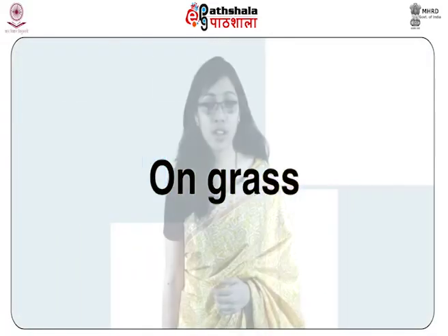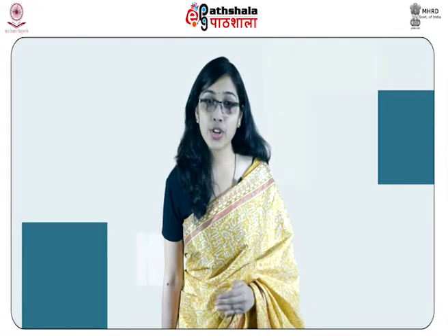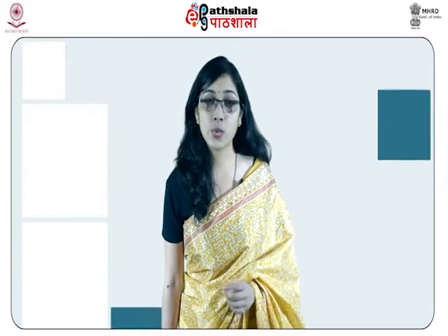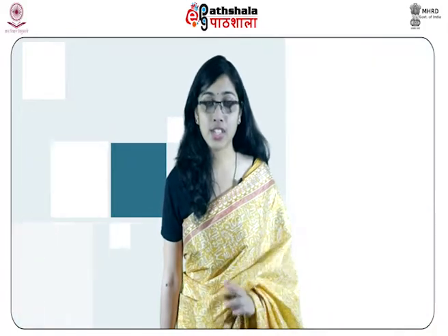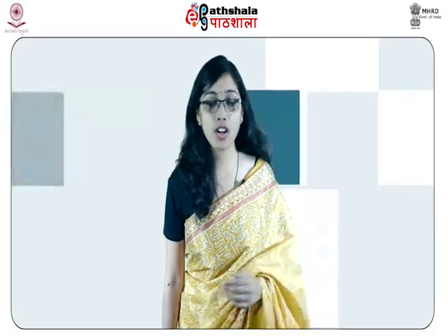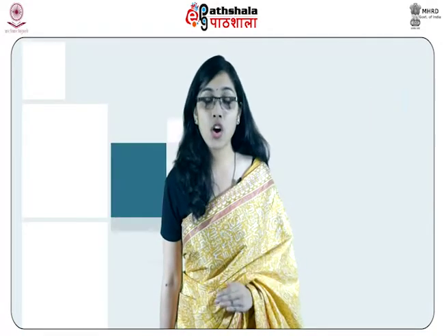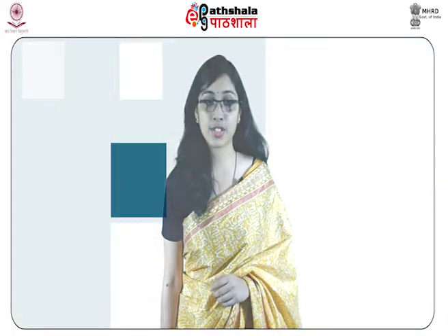On grass, when the blood is found on the grass, one should tie the grass with a thread, cut the tuft, dry it and pack it in an envelope or glass jar. Take care that the blood does not get dislodged in the process.